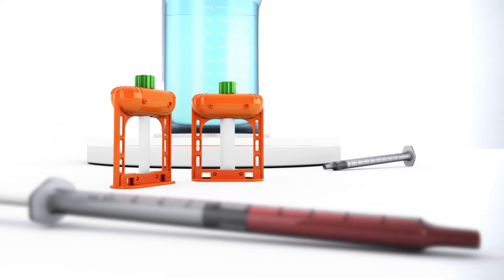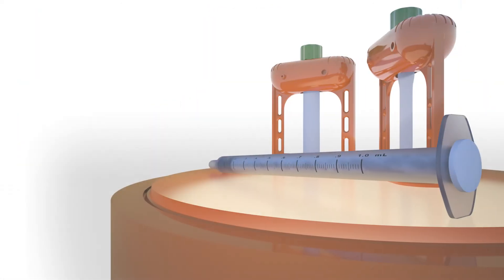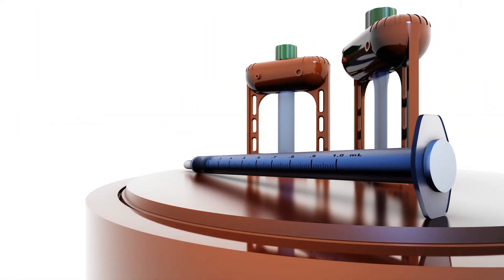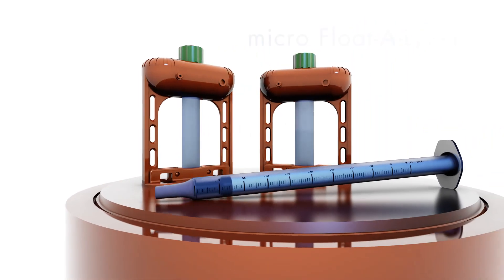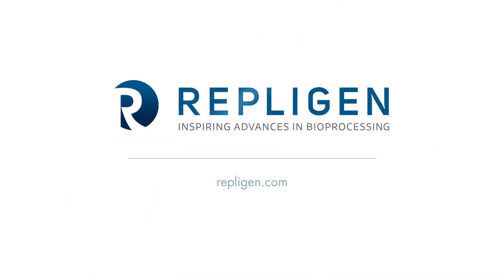Microflotilizer is the only easy-to-use microvolume dialysis device that offers smart benefits important for critical separations and total sample recovery, while maintaining 98% purity. Microflotilizer — it's not just easy dialysis, it's smart dialysis.